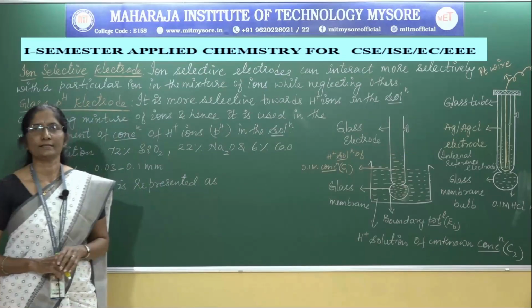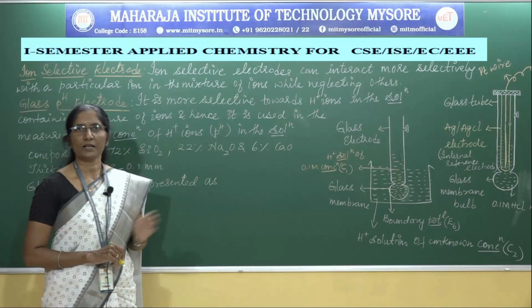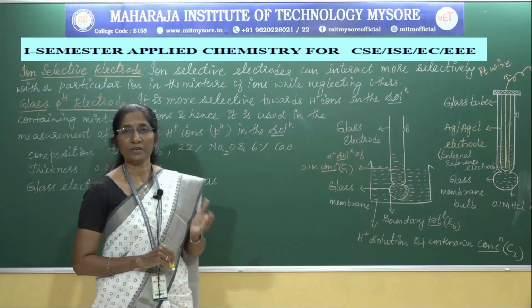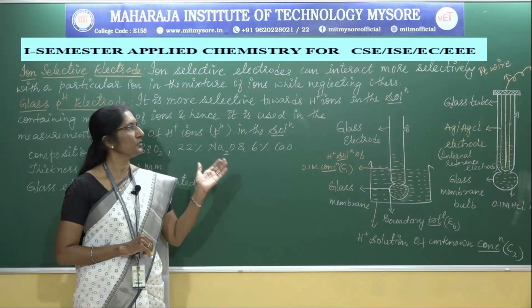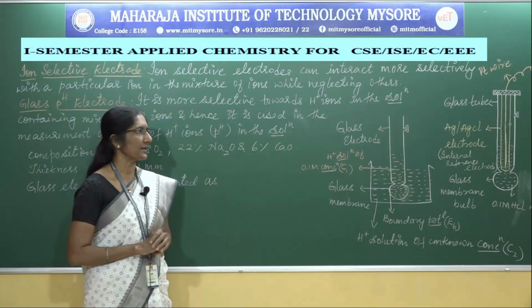Dear students, in this session we shall discuss ion selective electrodes. Under ion selective electrodes, we will study what ion selective electrodes are, their applications, and the construction and working of the glass pH electrode, and how the pH of a given solution is determined using this electrode.